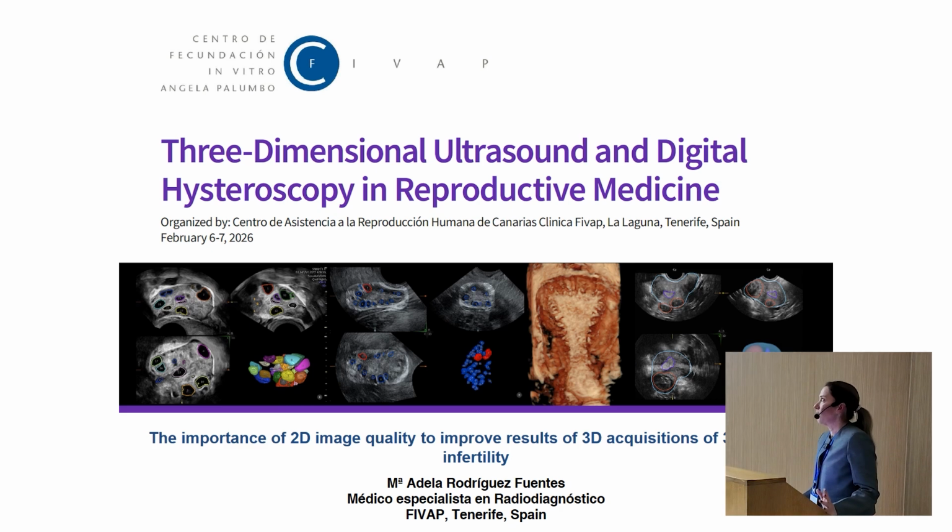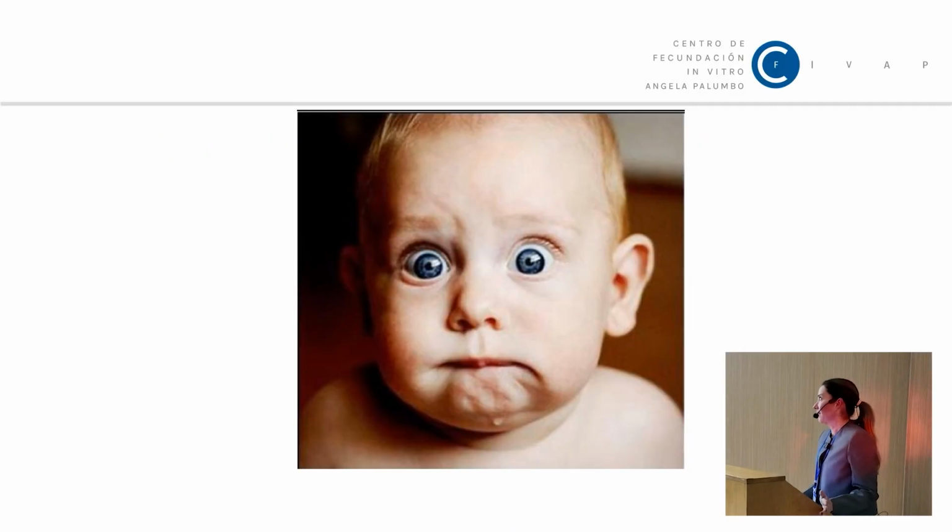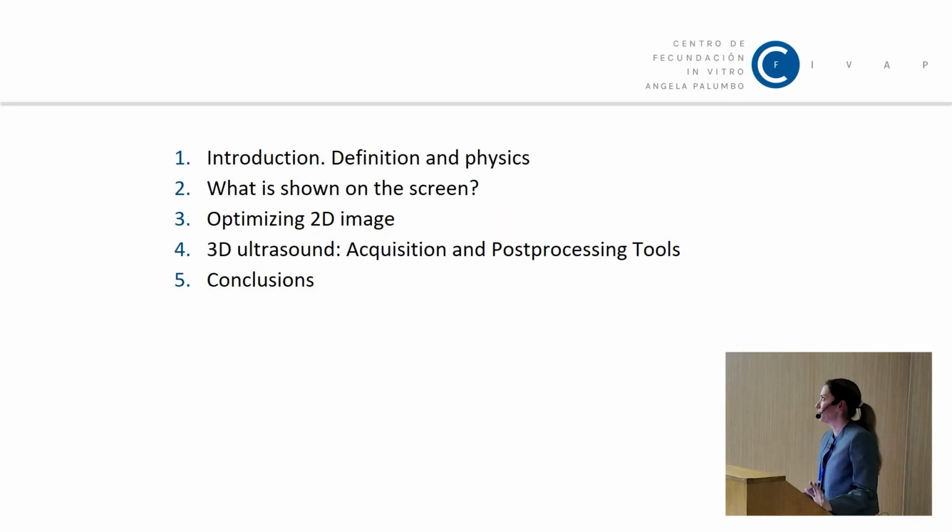As this is a quite hard topic, I think it's a good thing that Peter and Marcelo talked before me. We are going to review some of these topics and fix them. This is, as I said, a hard topic, but I will try to make it as easy as possible. This is what we are going to see.